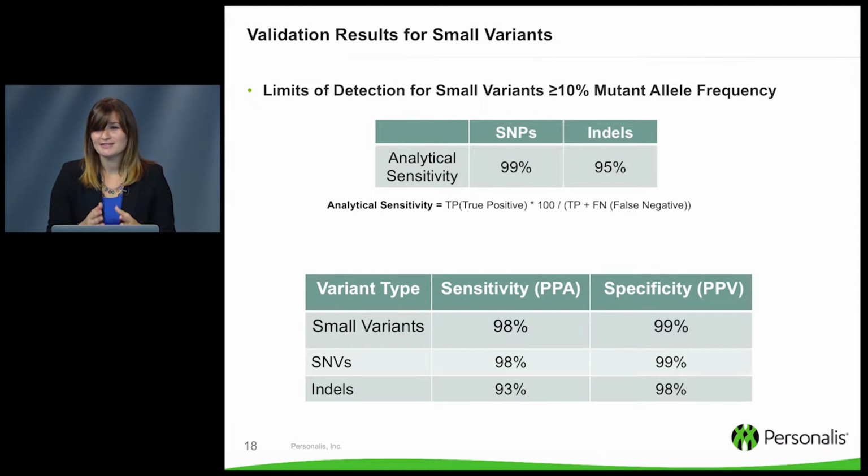So in total, validation of our ACE cancer exome required sequencing and analysis of over 70 samples and resulted in over 7,000 SNVs and 380 indels assessed. This just stresses the fact that more well-characterized reference standards are needed for large cancer assays such as ours.